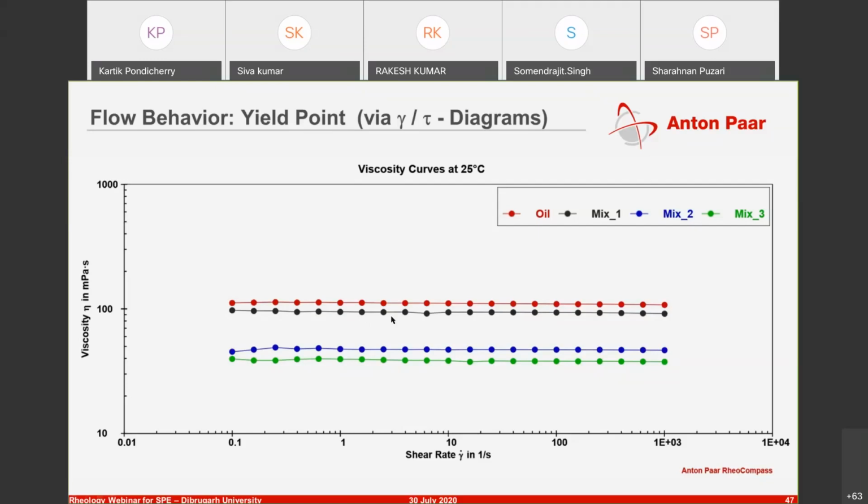So this is one additive that you added at 2%, and that caused a decrease. And then when you added 20% of the same additive, you had a much more significant decrease. And instead of that additive, you added diesel to it, again 20%, and you got a much greater decrease. So if you're thinking about the properties of the additive, its viscosity lies somewhere here.